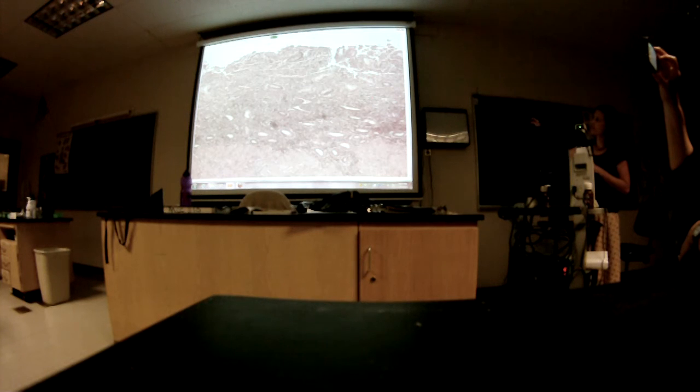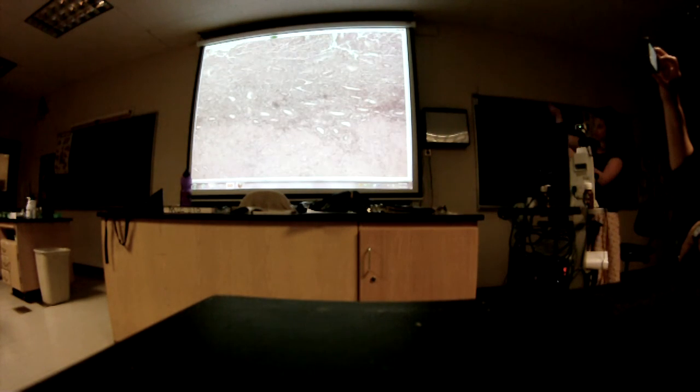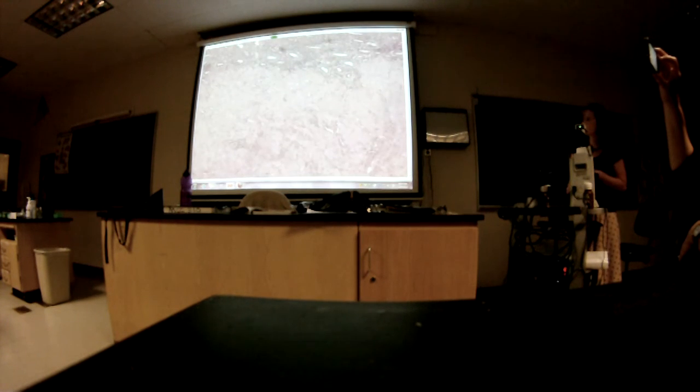And so here, parts of the endometrium are missing. Here's the uterine gland still. It's much thinner. Remember how thick the other one was I showed you? This is a thinner, shorter amount of endometrium. And it's actually turned the other way. This is the lumen up here. This slide just happens to be upside down. Okay, so then you can see the division there.